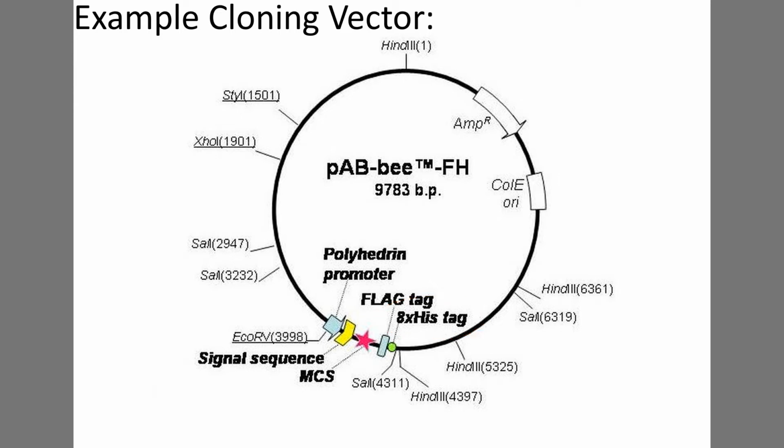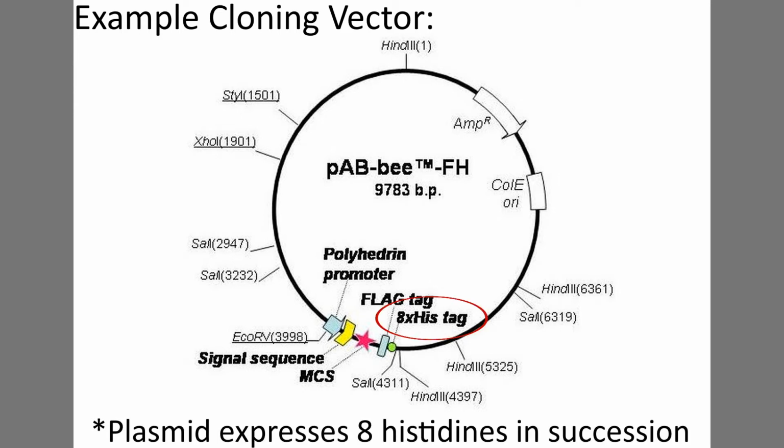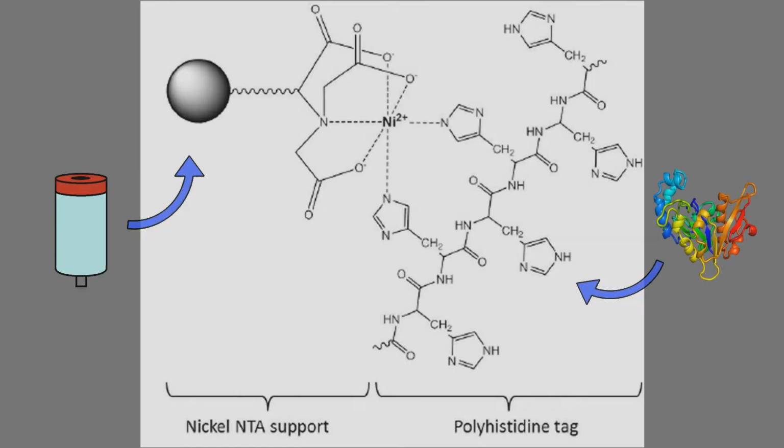Your expression vector was designed to include a tag portion at the end of your protein, which bonds strongly to the column matrix. Demonstrated in this diagram, we can see the histidine residues in a histidine tag bind very well to nickel ligands embedded in the column matrix.